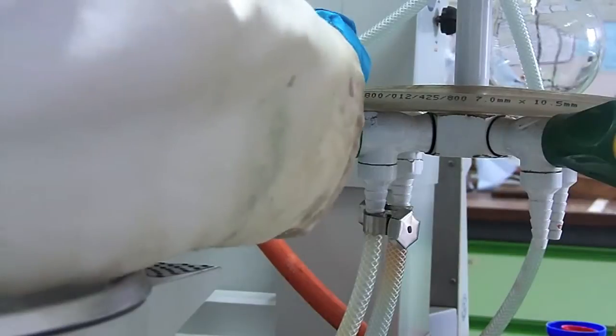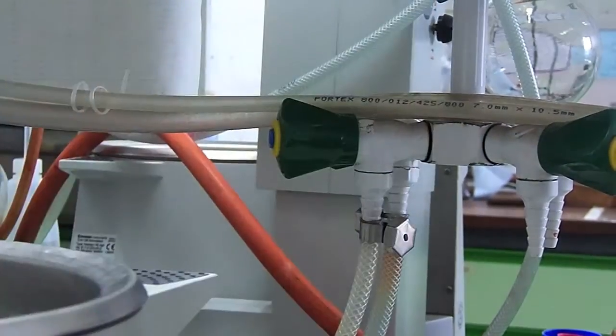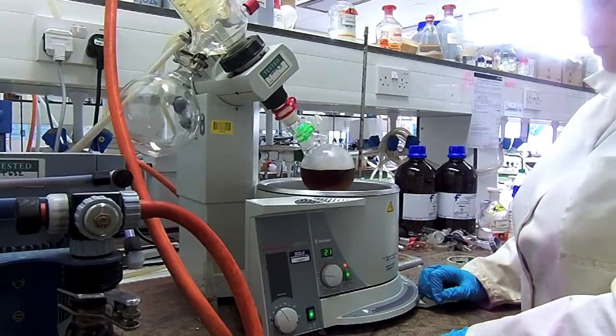You need to make sure that the water is turned on at both the pump and the rotary evaporator, and then switch both of these on at the plug. This should start the spinning and the heating on the rotary evaporator. You can then close the vacuum on the rotary evaporator and lower your flask into the water.